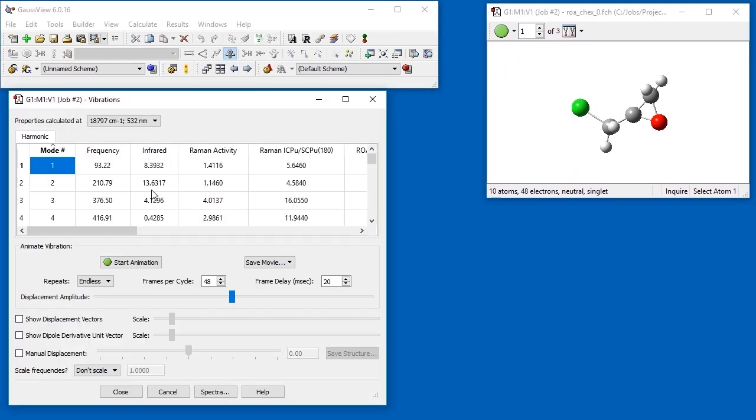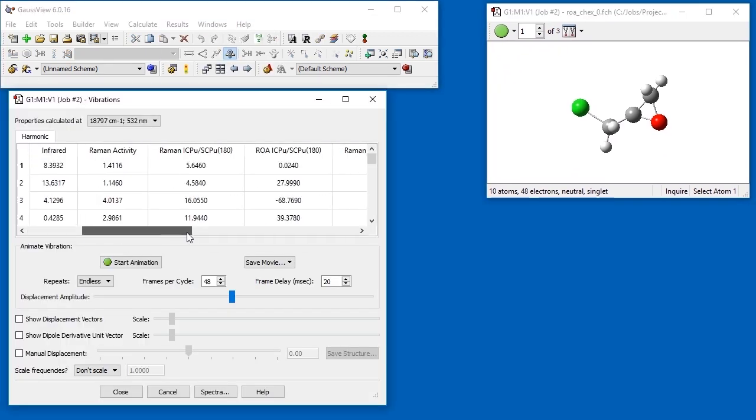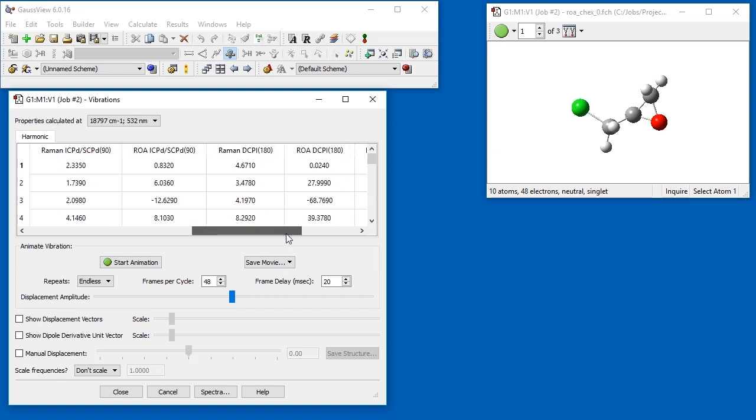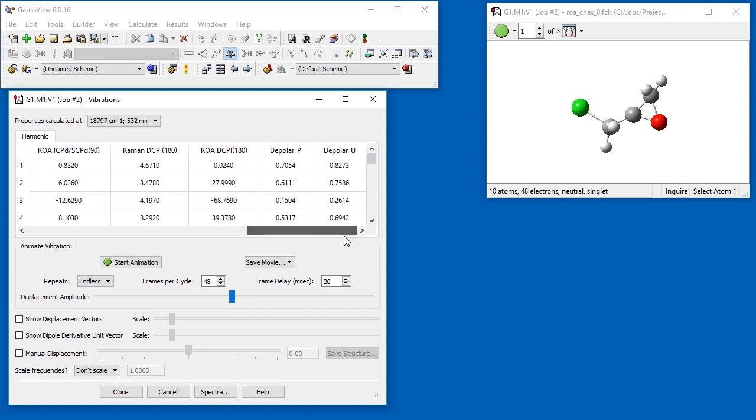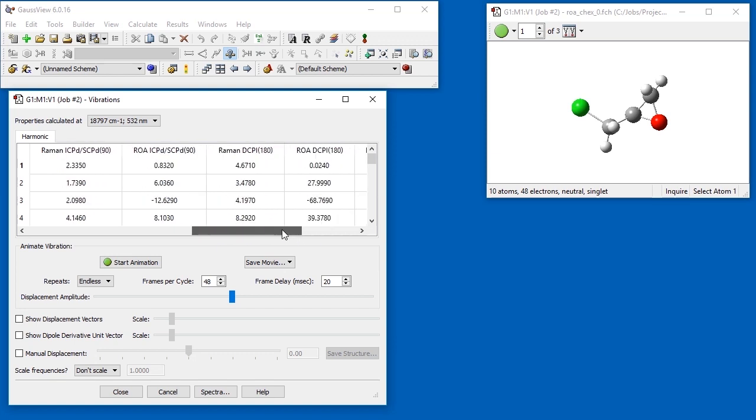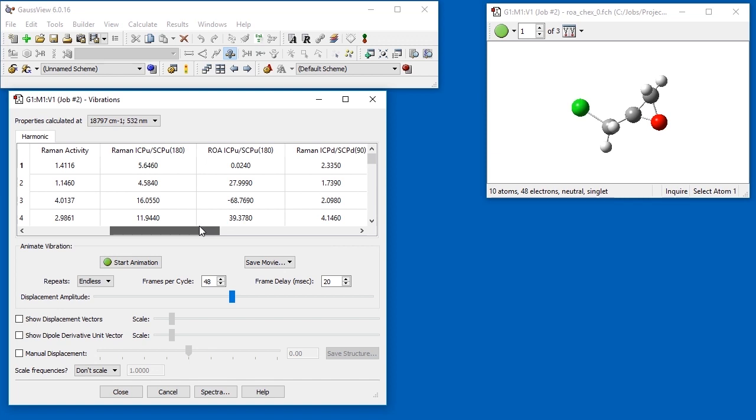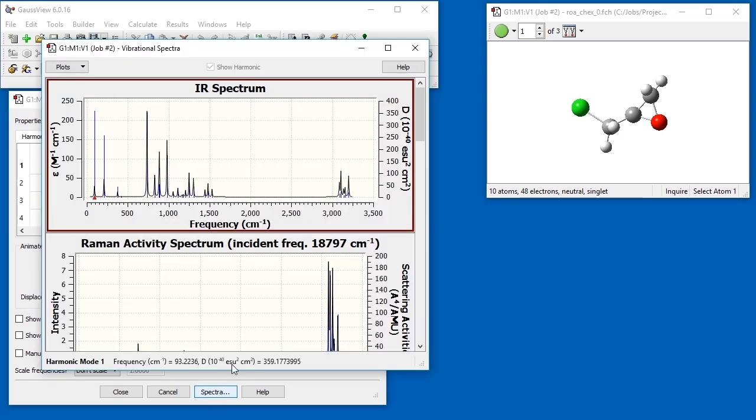When ROA data is available, there will be many additional columns in the modes list. There are several sets labeled ROA which correspond to different instrument configurations. You should select the one that is appropriate for the experimental data to which you are comparing. We open the spectra display and navigate to the appropriate ROA spectrum.